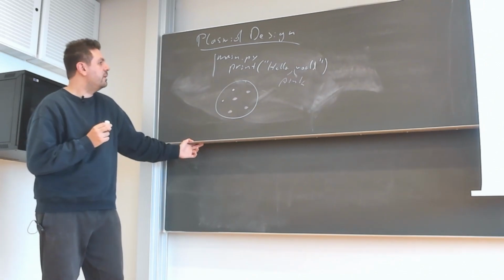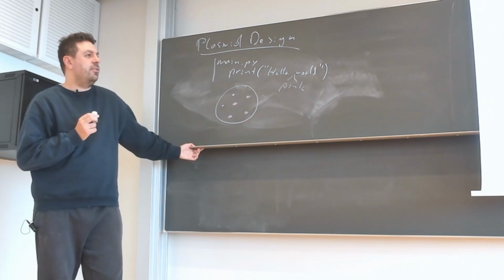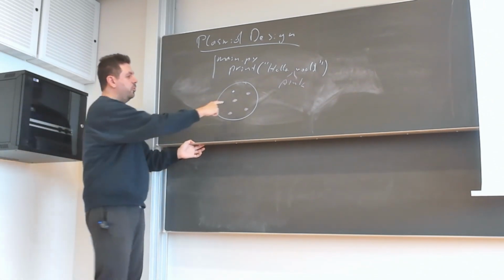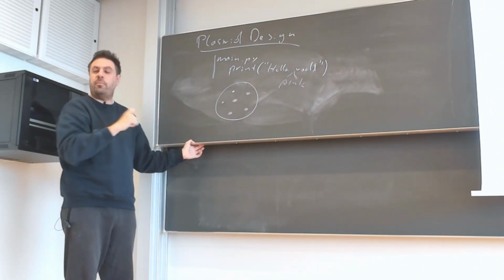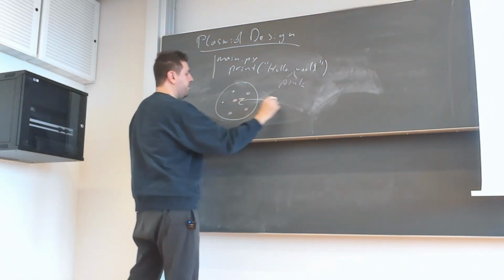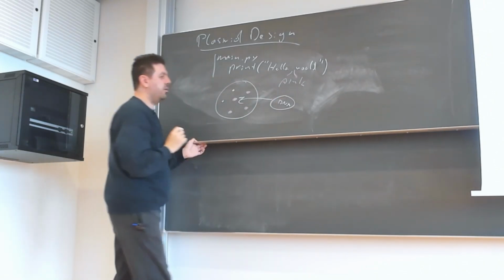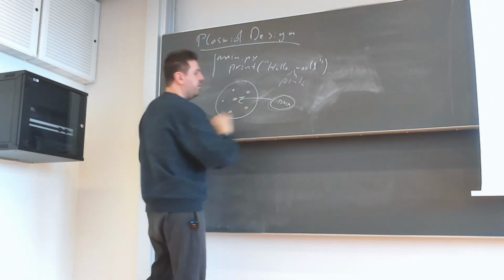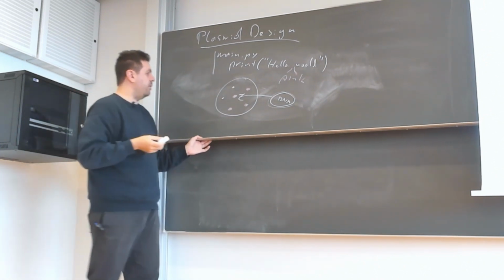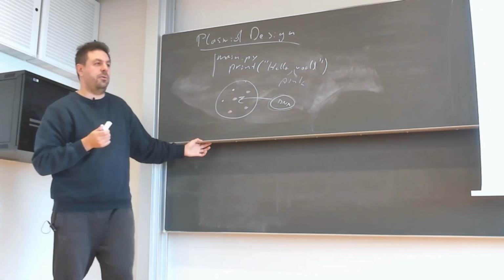Okay, so now that we are set up and we have the problem, we can start designing. By the way, when we talk about a design, we don't want to include this DNA code into the genome. That would be, again, too complicated. We just want to create a plasmid, right? A circular DNA. So, of course, double-stranded circular, and that we want to transform into a bacteria, and then this bacteria shows up pink. This colony shows up pink.